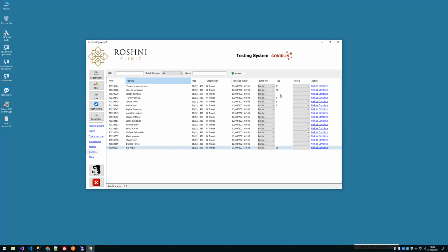I've got all these numbers. I've got A1, A2, A3, and so on. I've got all that recorded. I can just take a sample of each of these tests from the vials, and put it onto the well number. Drop into the well with the reagents, and then do the test. So the whole time that's happening, it's in the lab basically.